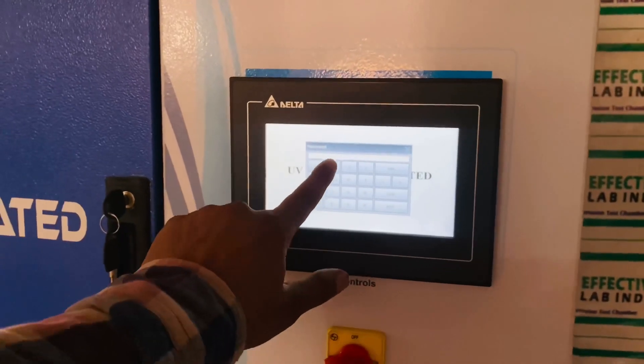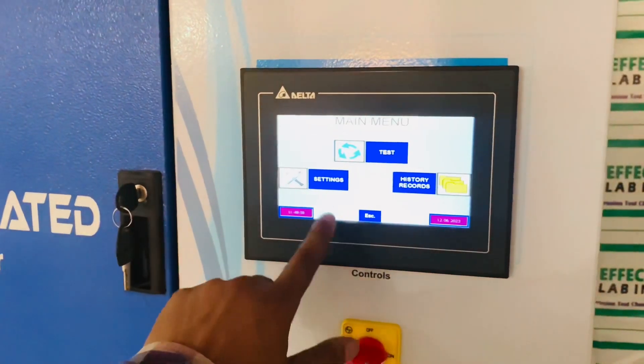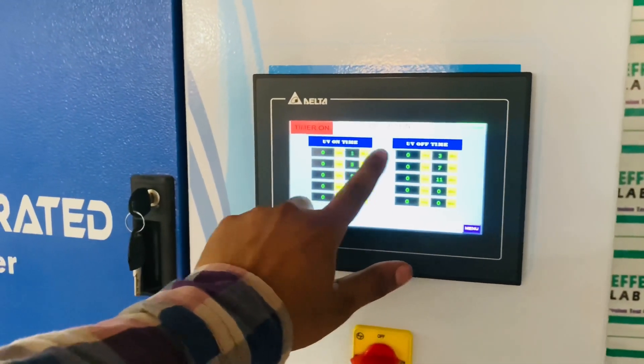Click anywhere on the screen to enter the main interface. Click the bottom settings; here you can set the test program and set the test parameters.